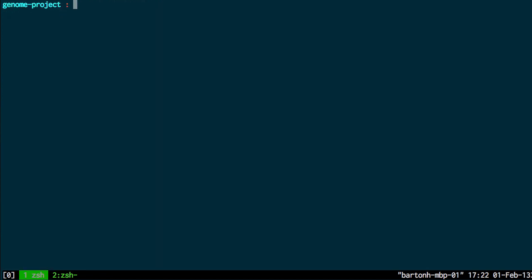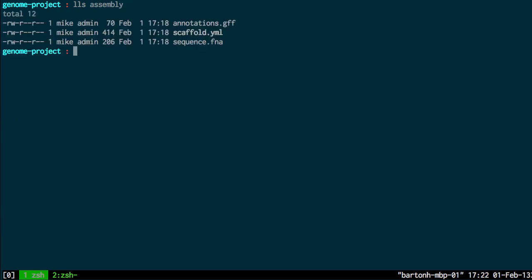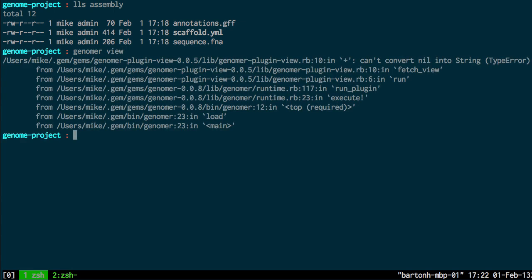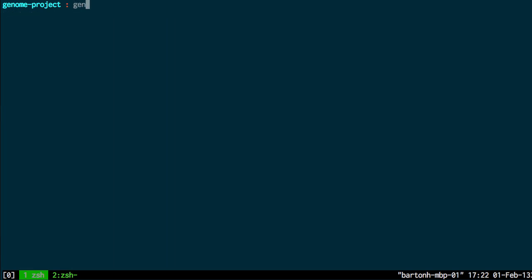And so it's relatively straightforward to use. Assuming that I have my contigs and sequences in the sequence fna file, and I specify my scaffold in the scaffold yaml file, then this command will work genomer view. I should have specified the type of genomer view FASTA. And that just gives me a FASTA view of the scaffold which is not particularly interesting.